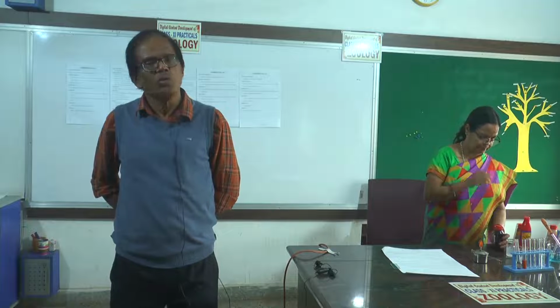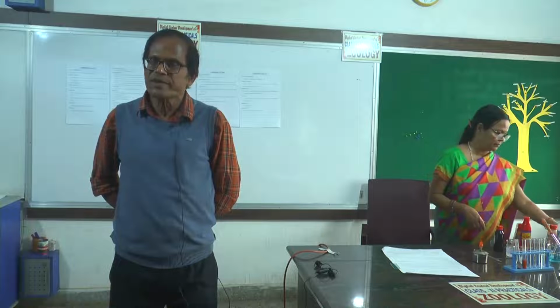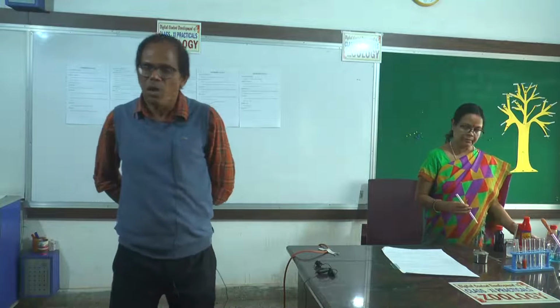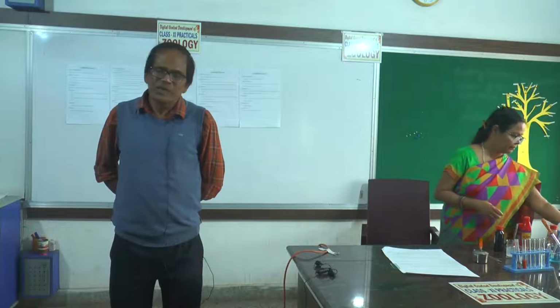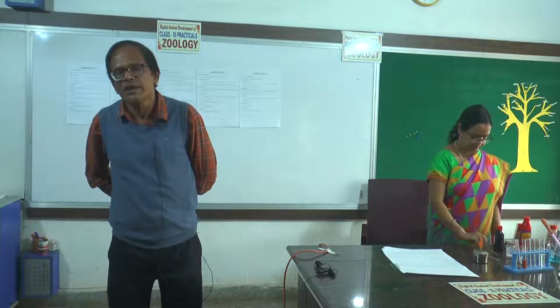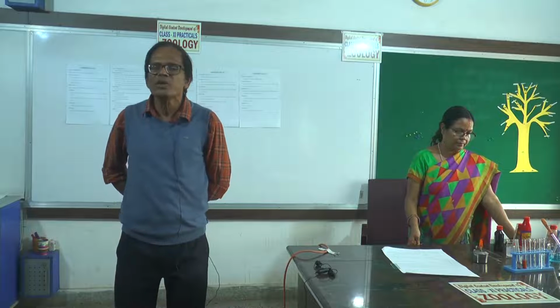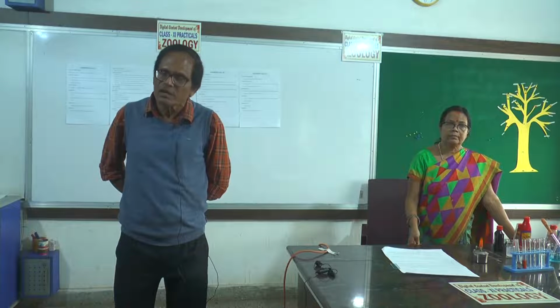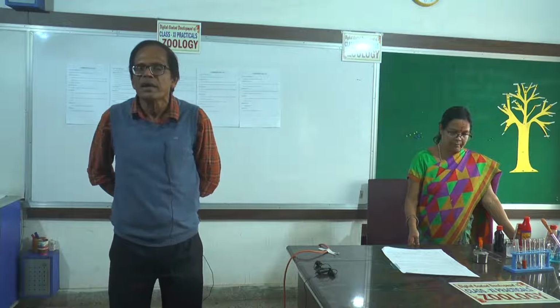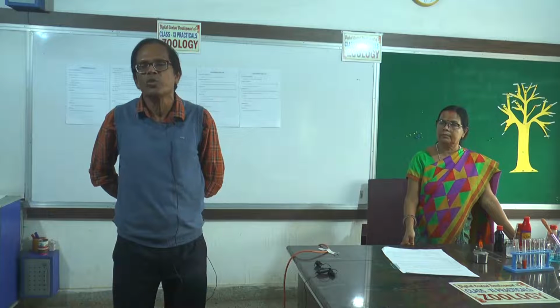The two monosaccharides are glucose and fructose. The first carbon atom of glucose joins to the second carbon atom of fructose, such that a glycosidic bond is formed. And the two carbon atoms are reducing carbon atoms. When both the carbon atoms are engaged in the bond formation process, how can it be reducing? It can't be reducing. You hydrolyze it, turn sucrose into glucose and fructose, then test for its reducing ability. It will give you a positive result. The same kind of precipitate, brick red color precipitate, will be formed.